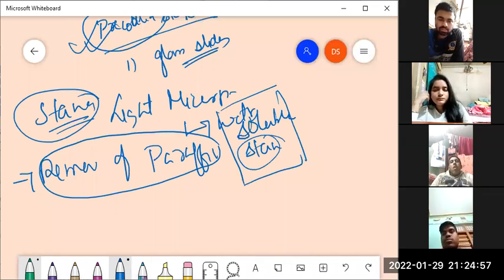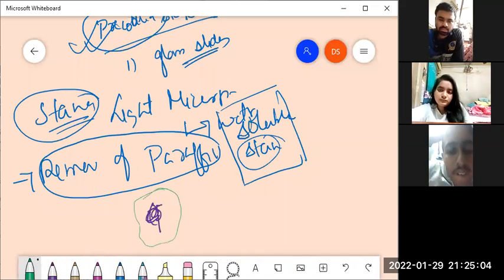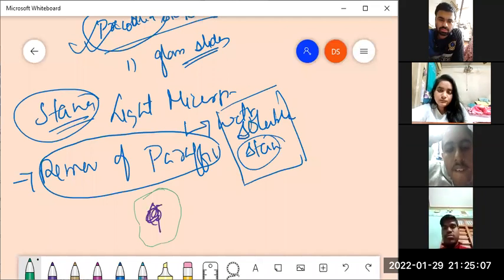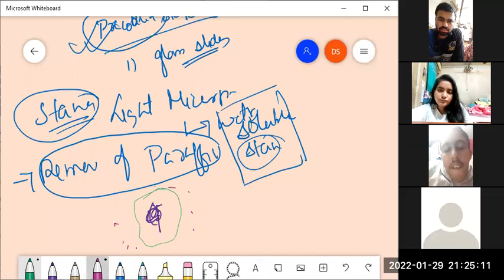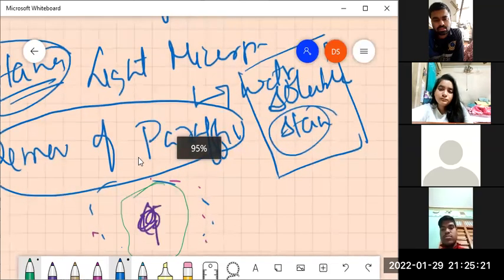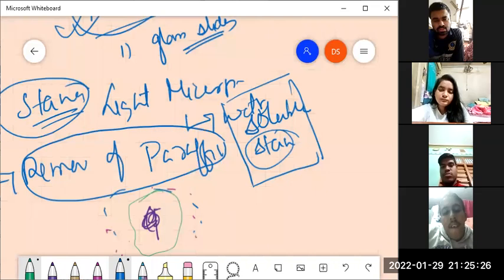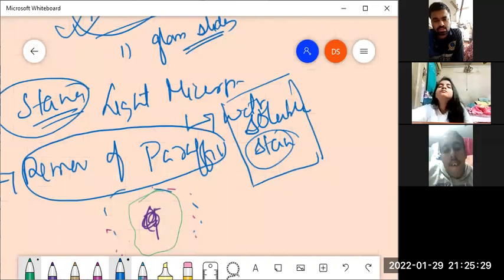Are you understanding? So putting the diagram again, if this be the tissue, surrounding the tissue in the green color, I was showing this paraffin. If this paraffin is retained, if say there are multiple stains on the outside, some of this color, some of the blue color, none of the stains being water soluble would be able to come in contact with the tissue because of the paraffin. So the paraffin needs to be removed from the mounted sections. Okay.